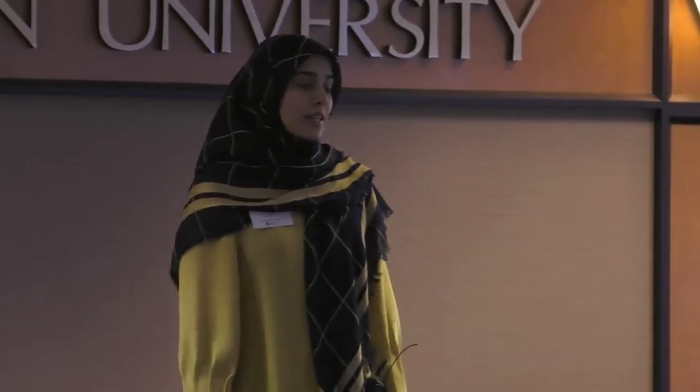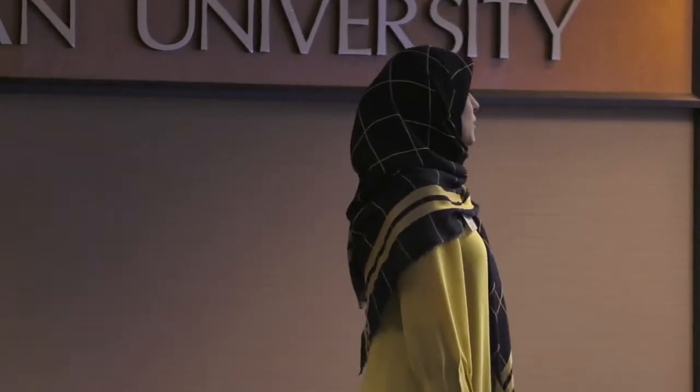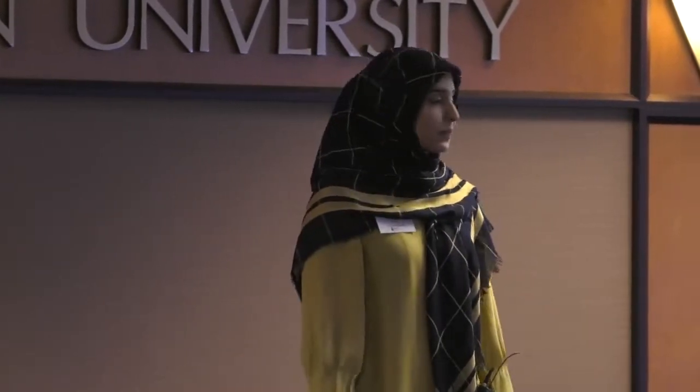I'm a PhD candidate from the Department of Chemistry, and the title of my talk today, which is actually the title of my dissertation, is Improving Protein Analysis from Surfaces by Desorption Electrospray Ionization, or in short, DESI.